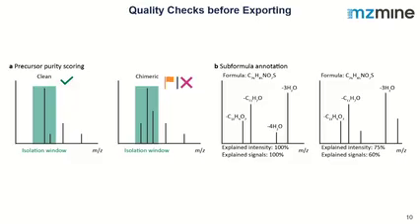It's definitely open to collaborate. So we now have 2 checks that we included. It's the precursor purity. So we have our MS1 data before triggering the MS2 and after triggering the MS2. And we go back and see if we have, in this isolation window, something very highly abundant next to the signal that we wanted to trigger the fragmentation for.